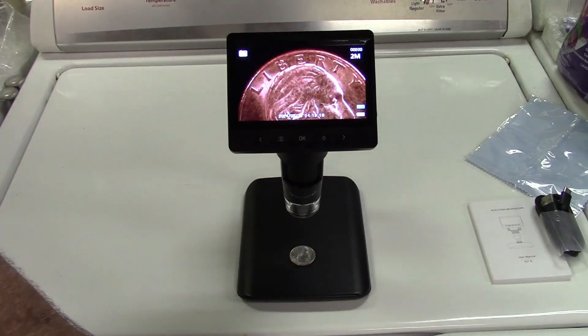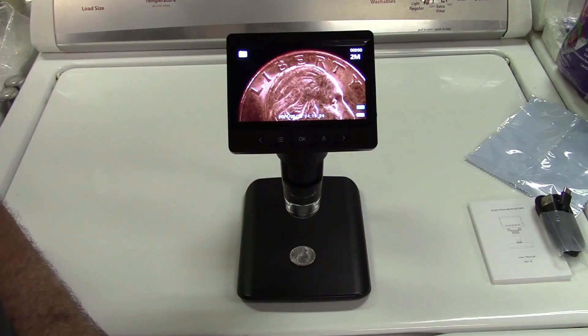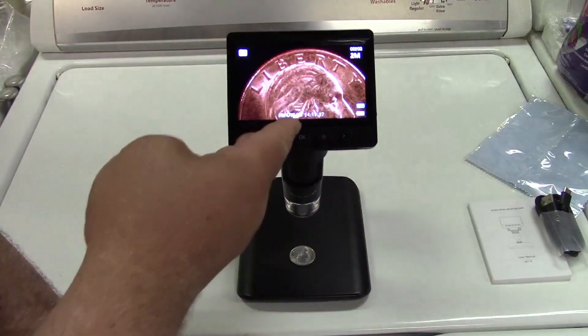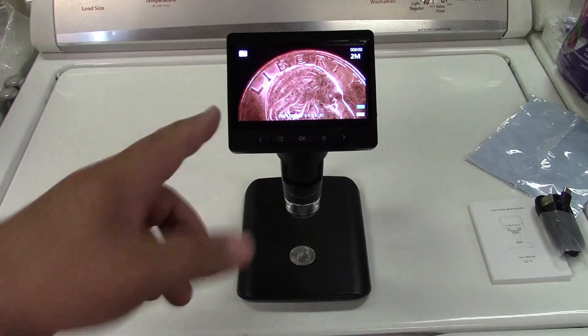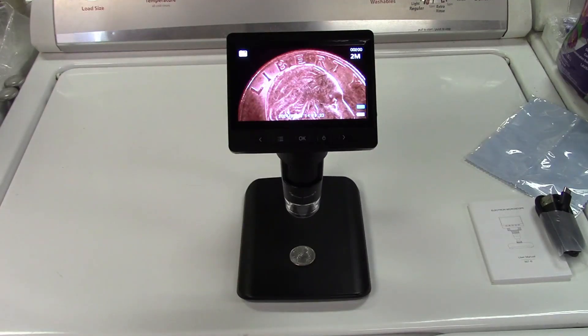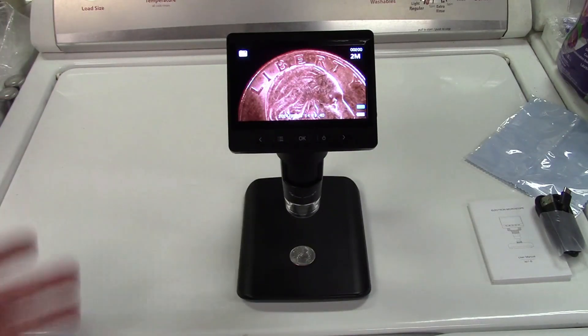Now I've seen reviews of this and people apparently forgot that this can record videos. So instead of my pointing the camera at the screen, I'm going to record video onto the micro SD card. And I'll put that into this video so you could see the actual quality of it instead of looking through a lens which is looking through a lens which is looking through a lens.